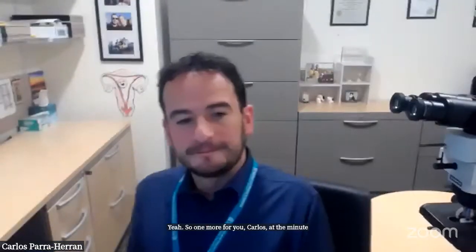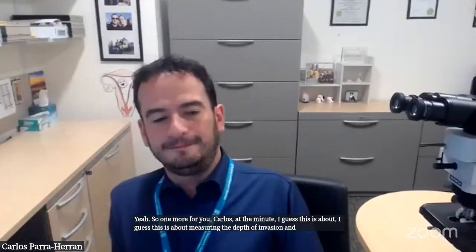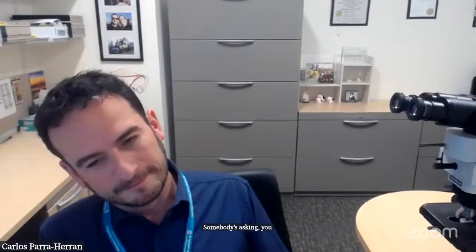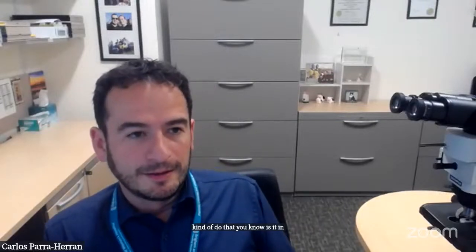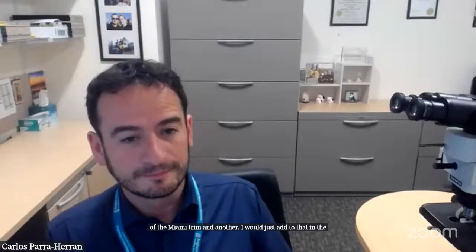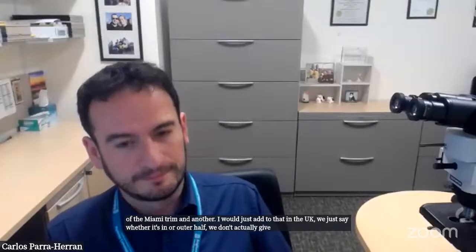So one more for you, Carlos, at the minute. I guess this is about measuring the depth of invasion, the depth of myometrial invasion, in endometrial cancers. Somebody's asking about the percentage depth of myometrial invasion. How do you do that? Is it in the area of the deepest invasion, or do you use the thickest area of the myometrium? And I would just add to that, in the UK, we don't measure, we just say whether it's inner or outer half. We don't actually give a percentage. So just your thoughts around those questions.